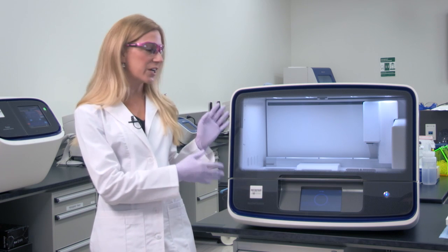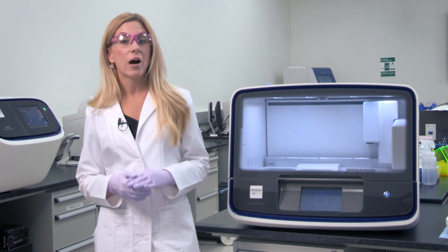Are you tired of the time it takes to manually set up your Ion AmpliSeq libraries? Well, then you need to take a look at the Ion Chef system by Ion Torrent, which now automates library preparation, as well as template preparation and chip loading, making it super easy to do targeted sequencing.